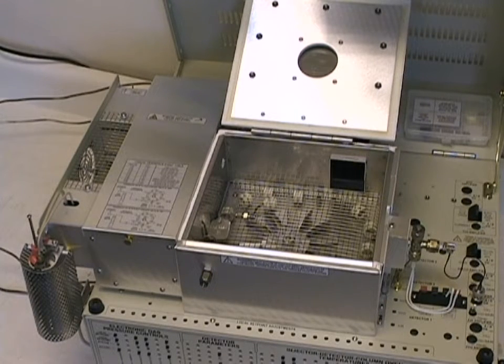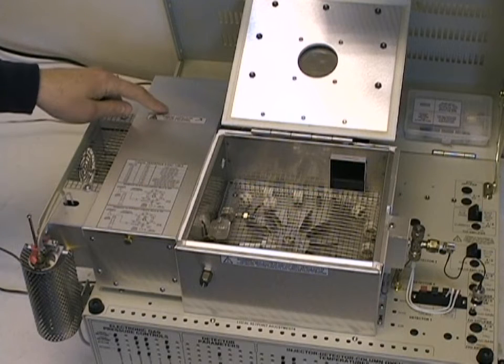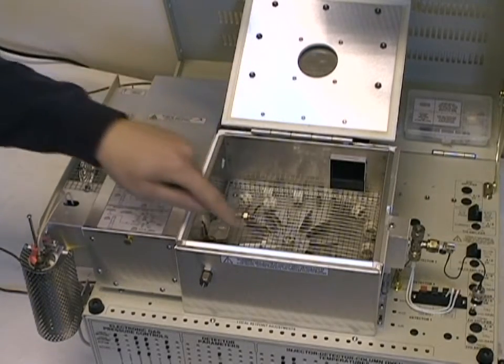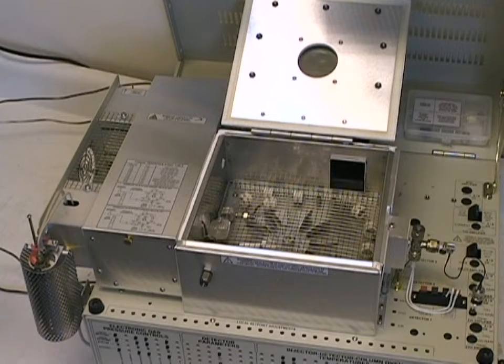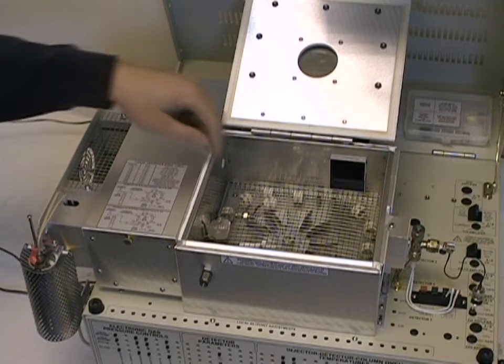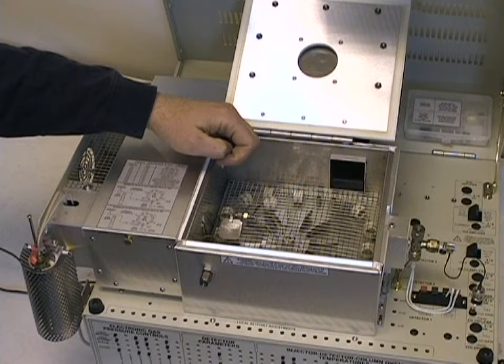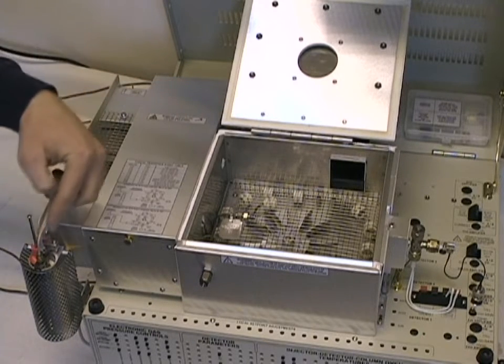Here are the inside components of the 910 Headspace GC. We can see there is a side oven for the gas sampling valve, which allows you to take a sample of your gas without fear of condensation by keeping the valve hot and warm. The large 8-inch column oven is where your analytical column will go, and in this particular system, we can see a clearly labeled fitting marked Column In, which will allow you to bring your gas sample from the Headspace Analyzer to the head of the column.